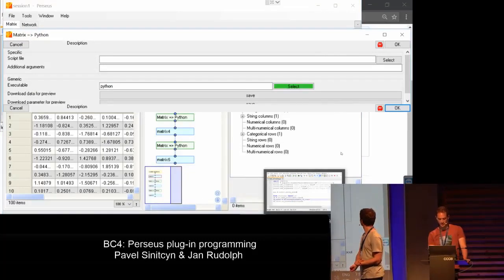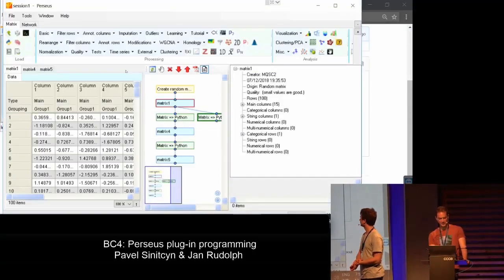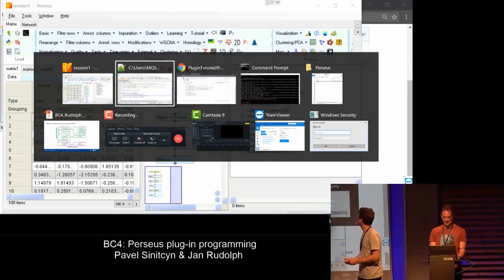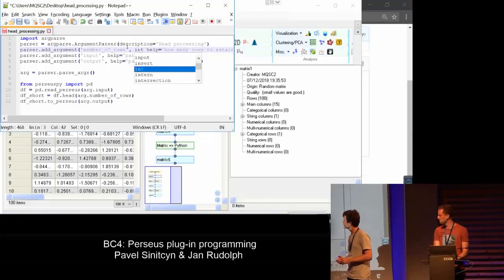Yeah, I already spotted one more mistake. So let's run into it. So if you say 100, but wait, we click OK. But we get an error. Of course, because you should write the name of this parameter before. Like, what is 11? So the issue was not that. The parameters here go by the order that we specify them, and the additional ones always go first. That's just something that you have to know. But that's why it's written in the documentation.